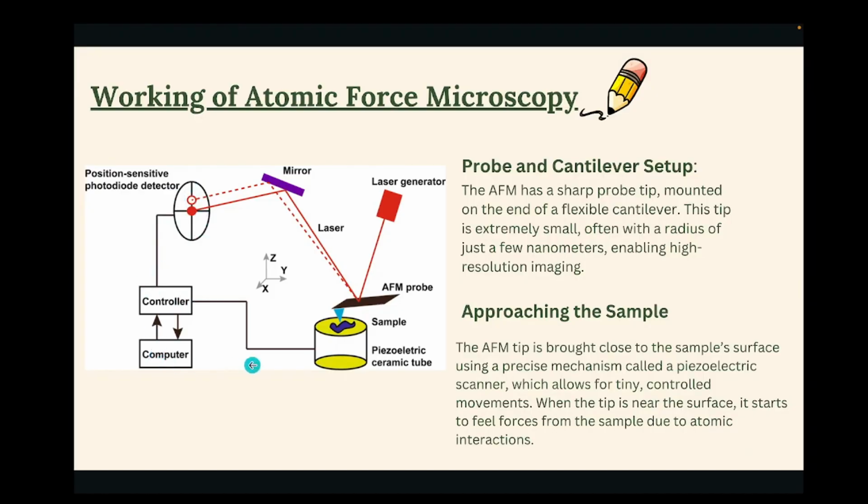So what happens: the sample is kept on the piezoelectric tube. When the computer is set, the set point is set, and the tip starts moving over the sample.